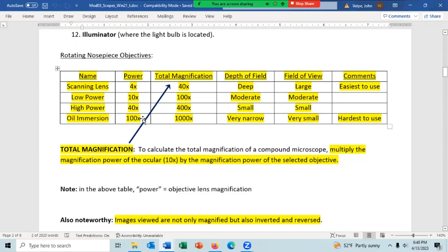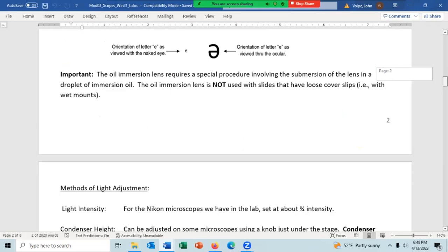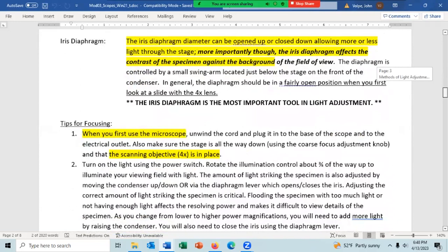to the field of view, you will get Köhler illumination, and I'm not German, so I could be butchering that, and that will give you the best contrast to see the specimen, meaning it'll give you the best ability to see the specimen, and there's a term for that, I'm losing it. I forget. I'll have to look it up. Sorry. The best contrast for sure, so that it'll stand out the best from the slide.